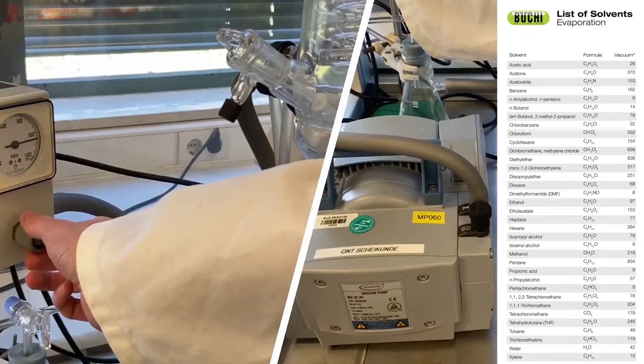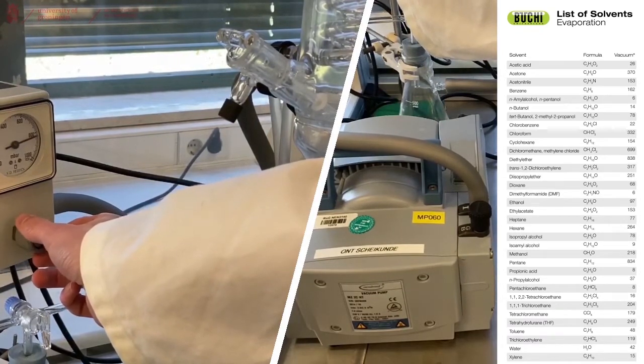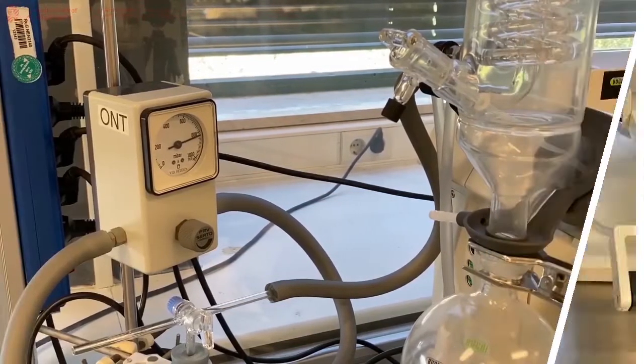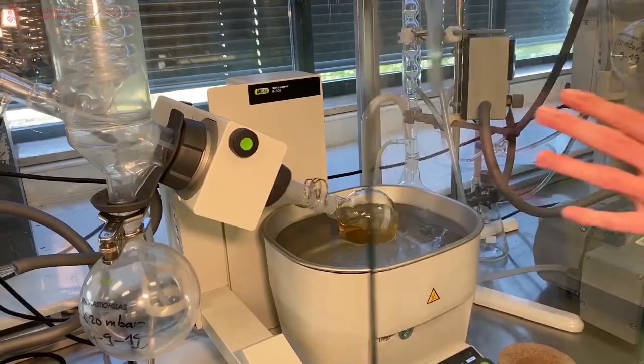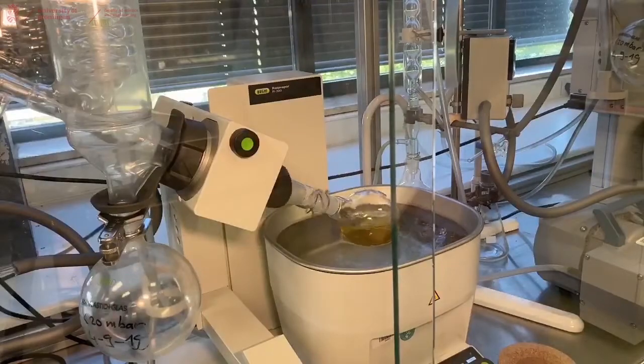Every Rotary Evaporator is equipped with a list of solvents and the required pressure. In this case, 800 millibars. We close the glass in front of the Rotary Evaporator. And wait until our solvent starts evaporating.